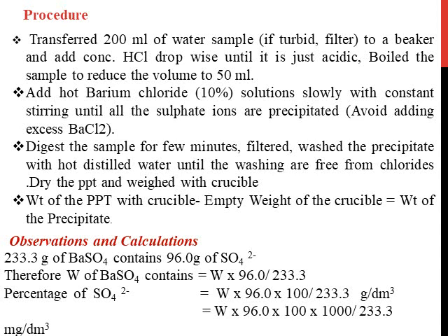Then the entire precipitate is digested for a few minutes, and the precipitate is filtered using a Buchner funnel or a normal filter paper.